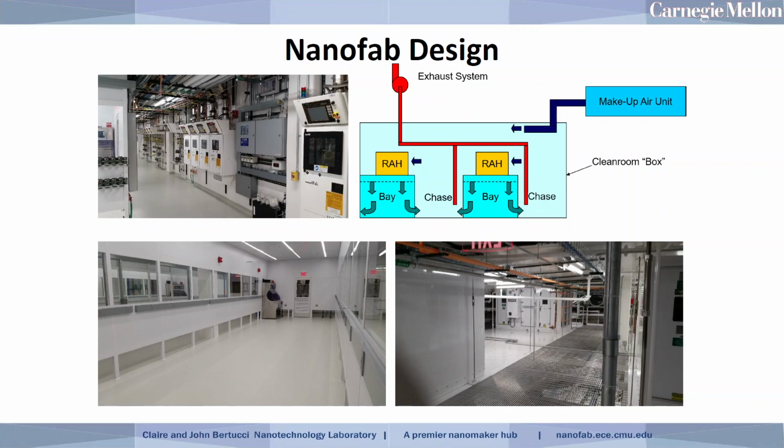Now, one of the cool things about our cleanroom is that it is very energy efficient. The energy efficiency is derived from the fans that are within the return air handlers, and they're all set up and sized to run at peak efficiency. So our cleanroom uses about 60% of the energy of an older style cleanroom from previous years.